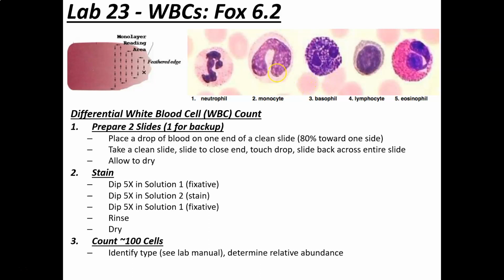But the basophil has these dark staining granules, and oftentimes it's impossible to distinguish the nucleus. But if you do, you often see an S-shaped nucleus. This one's really not S-shaped though, but you often see an S-shaped nucleus. At least it's usually bilobed in some way. Basophils are very rare. Books will say 0 to 1% of your blood cells, and typically less than 0.5, which means that in order to see a basophil, you might have to literally count a couple hundred cells before you find one, and they're relatively rare to find in lab.